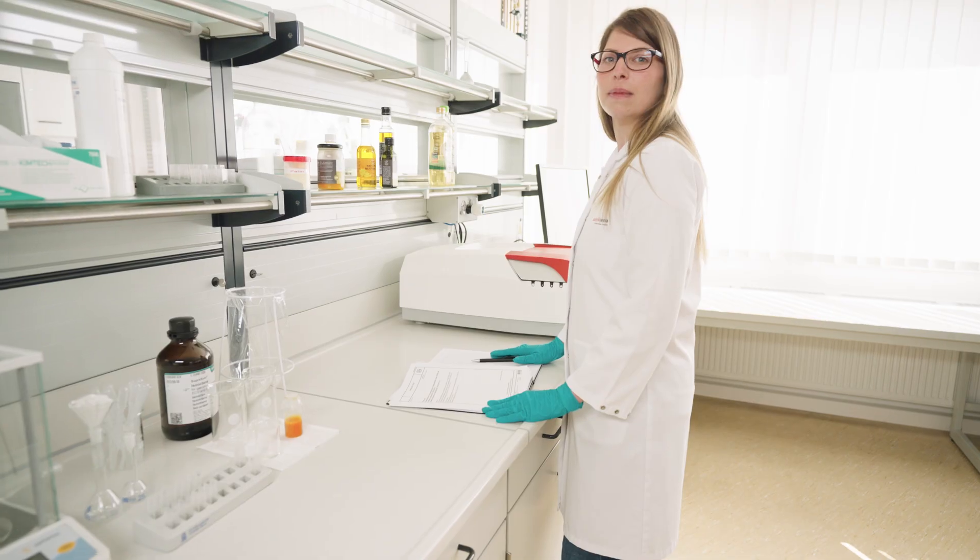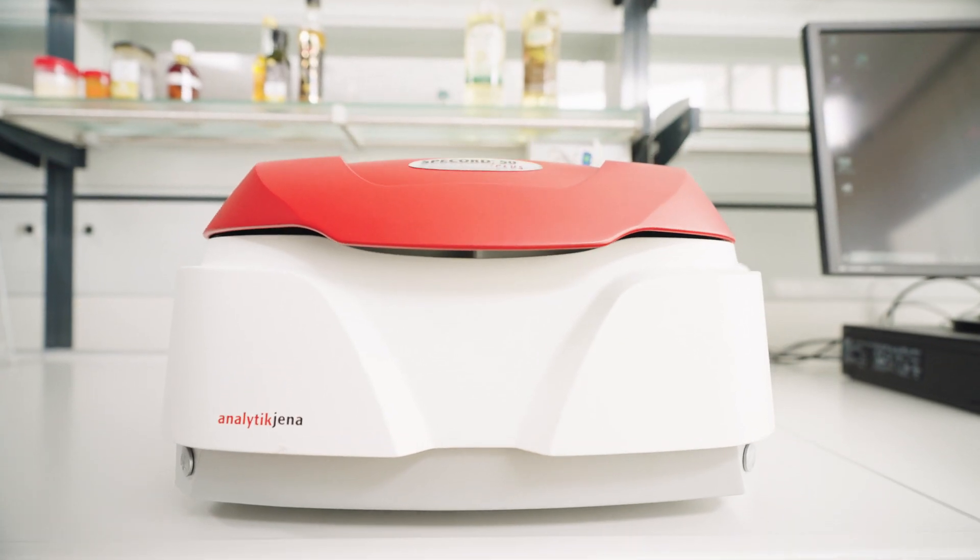Hello, my name is Francisco and together with my colleague Sandra, we would like to give you some tips and hints about how to optimize your analysis of oils using a UV-Vis spectrometer.